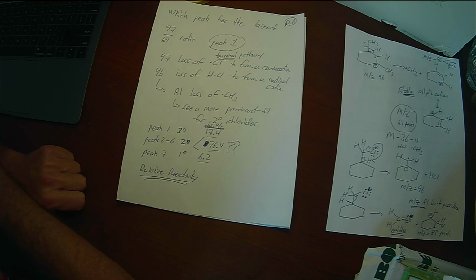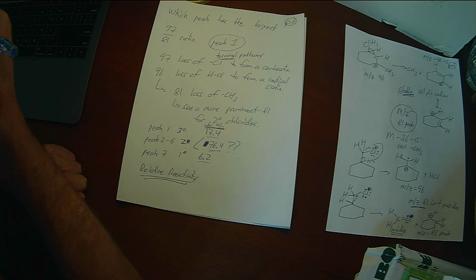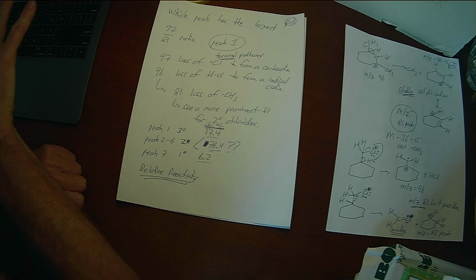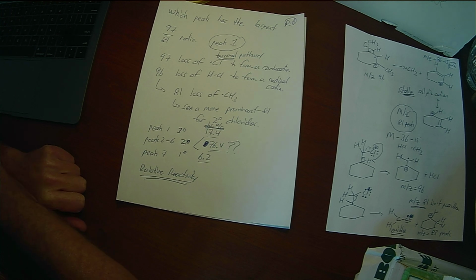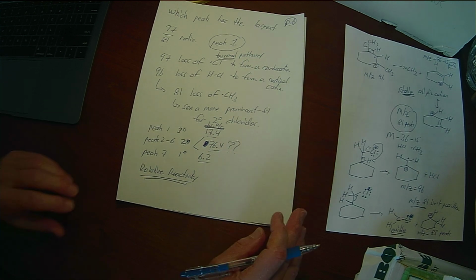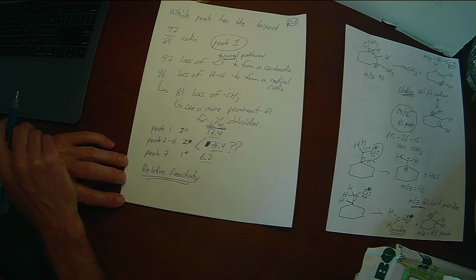The only significant peaks in any of the mass spec were the loss of methyl at 117, the loss of HCl at 96, the loss of chlorine at 97, and then the peaks at 81 and 83. The rest of the stuff at 55, that's the ring falling apart and giving weird fragments. You always see peaks at 55. So those aren't really something you would ever need to look at in diagnosing the spectra. But I did want to tell you where all the major peaks came from, especially since the base peak is one we didn't tell you about in the lab manual. We'll cover mass spec in a lot more detail in the second semester course.